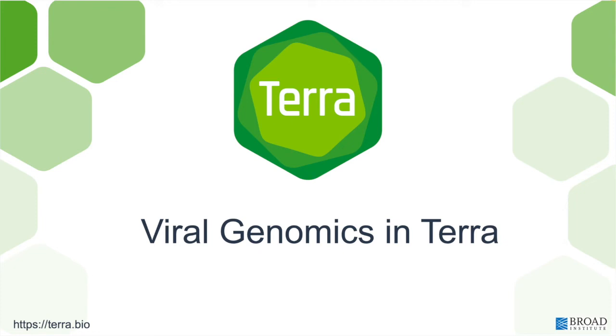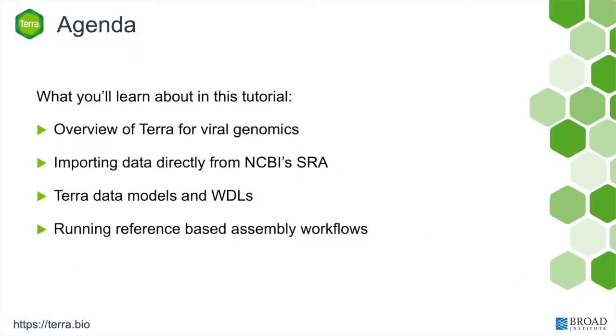Hello, and welcome to the Terra 201 tutorial, demonstrating the use of Terra for viral genomics. This tutorial will cover importing data from NCBI's SRA into our COVID-19 workspace, running workflows with the data, and using Jupyter Notebooks to run a quality check on the data. We'll begin with a short overview of how Terra works on the cloud.